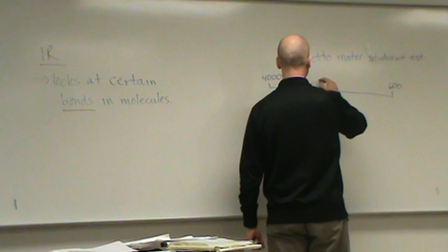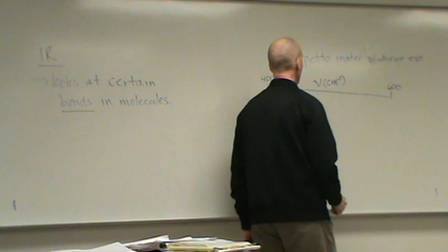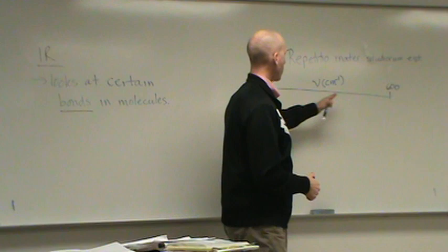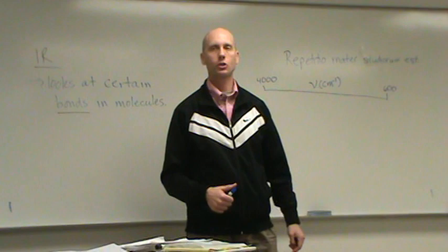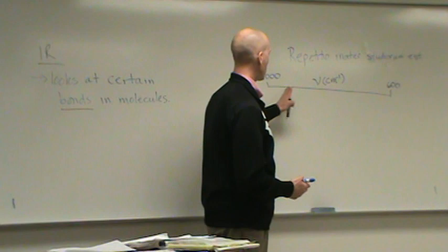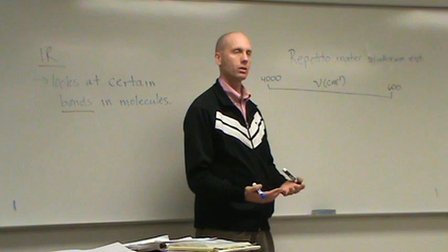So these are my frequencies in reciprocal centimeters. Sometimes you'll hear these frequencies called wave numbers, but we'll just stick with frequency. Okay? And this is where all the bonds are going to show up between 4,000 and 600. I'm going to give you the certain ones that are trademarks that we're going to be looking for in molecules. Okay? And these stretches are going to look like what are called upside down peaks. Okay? So let me give you the first one here.